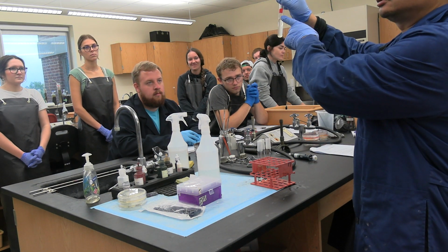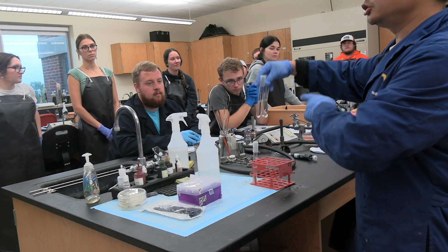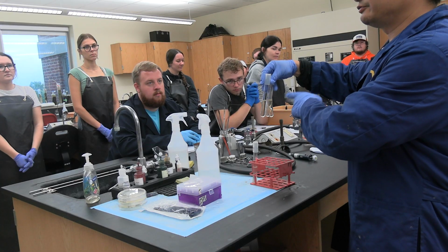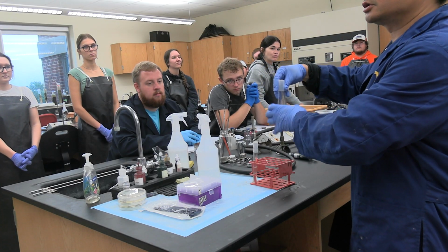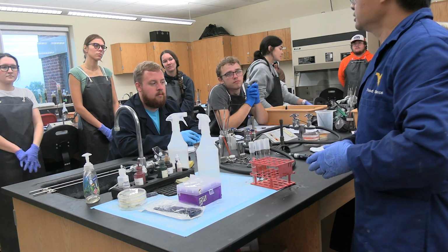Okay, this E. coli returns to the front desk. Your dilution tube is biosafety, biohazard trash. So give to Rion. We're going to put it on the side and we'll autoclave it. Okay, that's all we have.